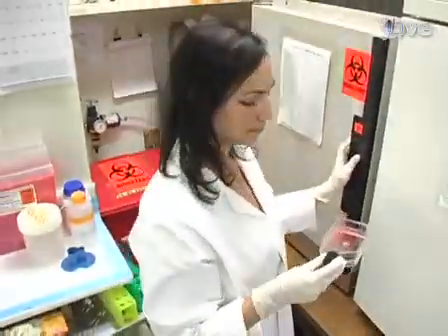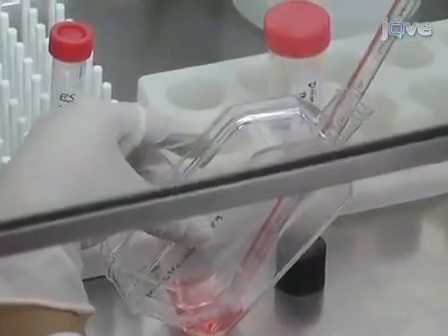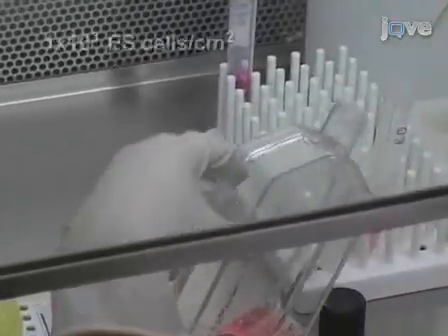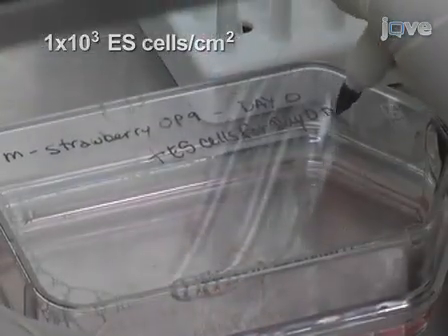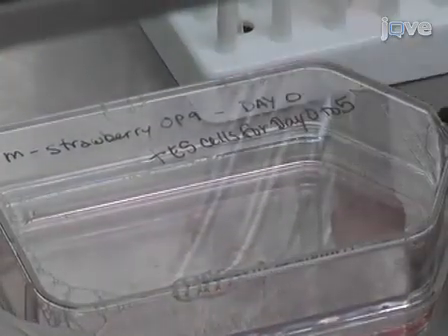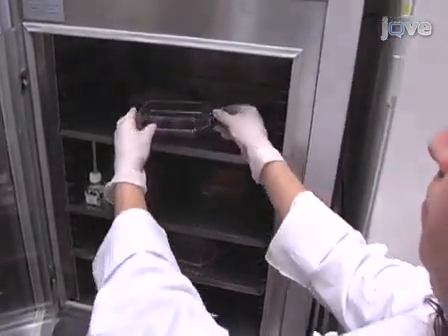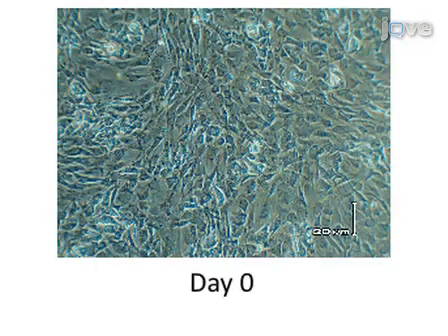Now retrieve the flask of M-strawberry OP9 cells from the incubator. Remove media from the OP9 cells and add co-culture differentiation media to the flask. Plate 1 × 10 to the 3rd ES cells per centimeter squared to each flask of M-strawberry OP9 cells. Incubate cells at 37 degrees Celsius, 5% carbon dioxide with humidity. This is day 0, and the co-culture should look like this.